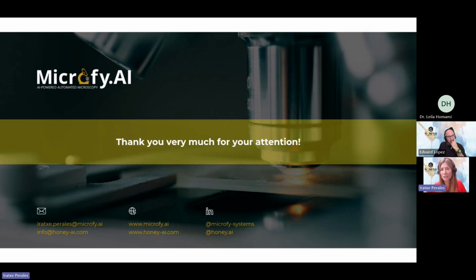So they were interested in buying our system for routine analysis of honey samples from Spain, because they have to do it manually. So they requested us to do a validation. So we sent the device to them, and they analyzed twice by their expert, pollen expert, and University of Córdoba, also palynologist, all the samples that they were receiving during 5 months.